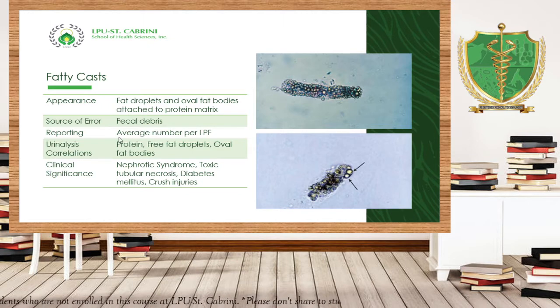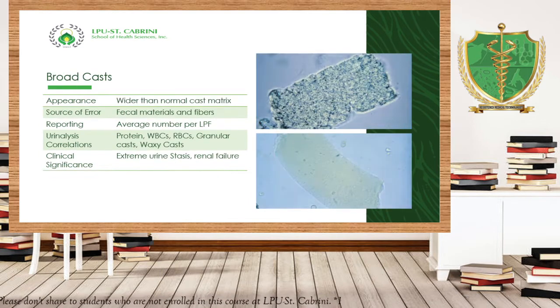And fatty cast is correlated with nephrotic syndrome, toxic tubular necrosis, diabetes mellitus, and crush injuries. Ano po yung crush injuries? Ano yung magkagusto ka o sa injury ka? Well, bahala ka kung ganun ang gusto mo. Pero yung crush injuries po, yung mga na-aksidente.